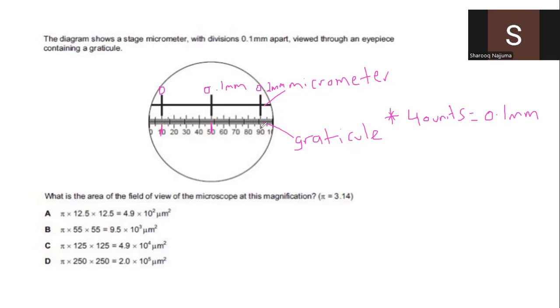The difference there is 80. 90 minus 10, you get 80. Someone can still use the same, that 80 units are equivalent to, you can see 80 is well aligned with 0.2. From here to this side is equivalent to 0.2 millimeters. You just choose what to use. You use what is easier for you. Yeah, you always have that choice.